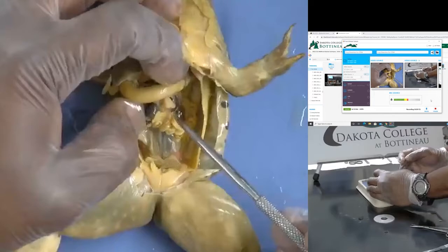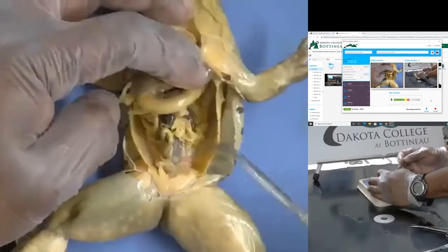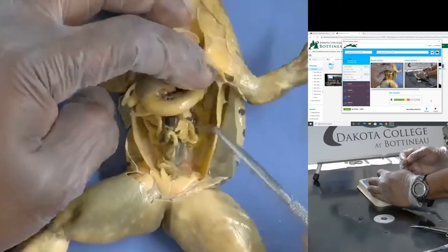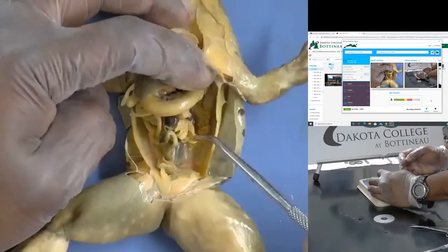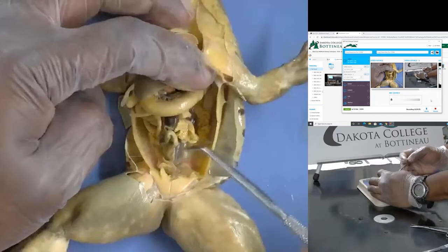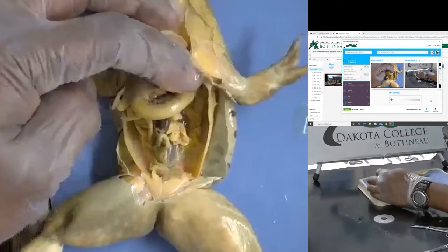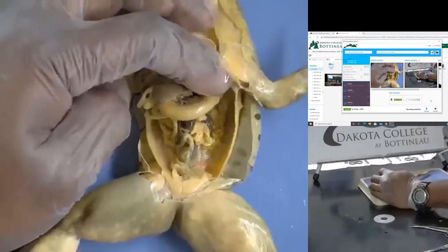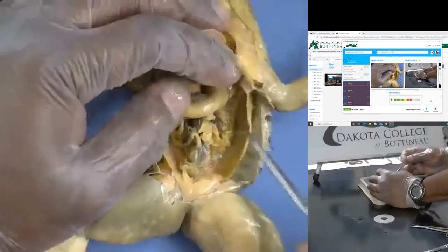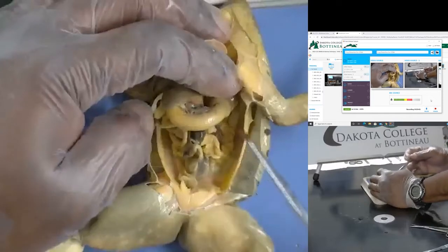When this frog has lots of eggs in its ovary, it will fill up the entire cavity. You'll see, and some of you may already have seen when you opened it up, this sac full of eggs, kind of black and white eggs. Any of you have a female full of eggs? No. I think I have a female, it's not full. Okay. So some of you may get such a frog with the ovary full of eggs, and these are the oviducts.